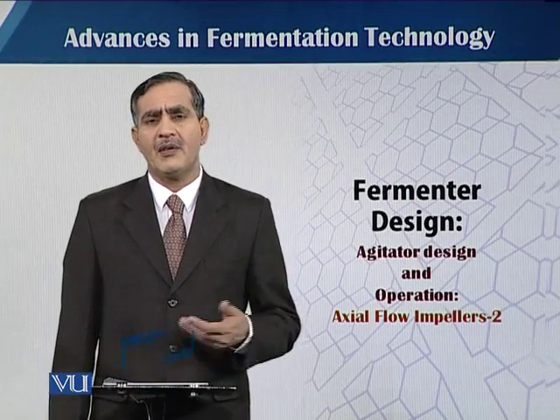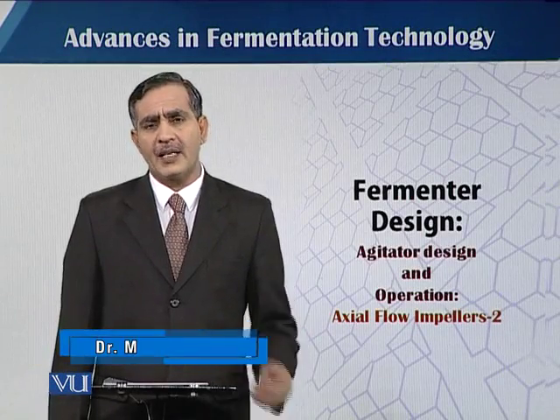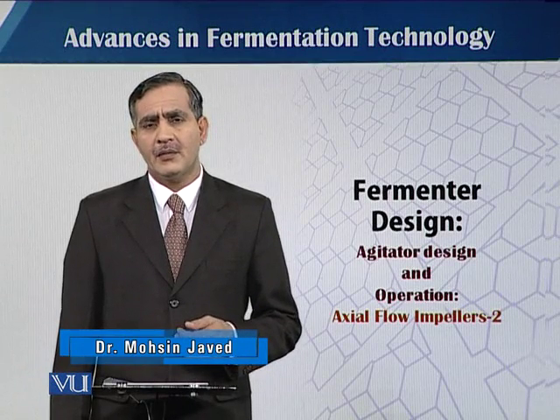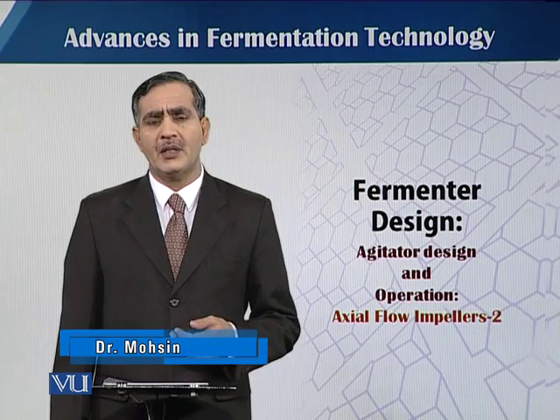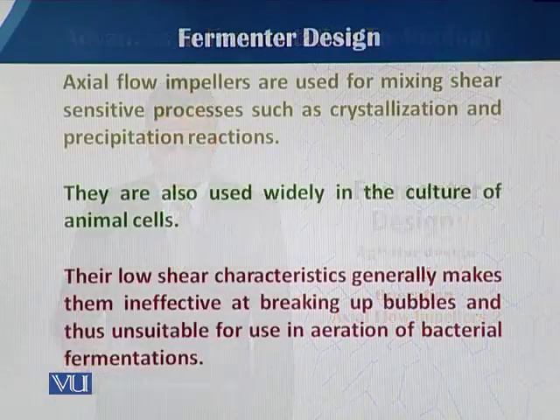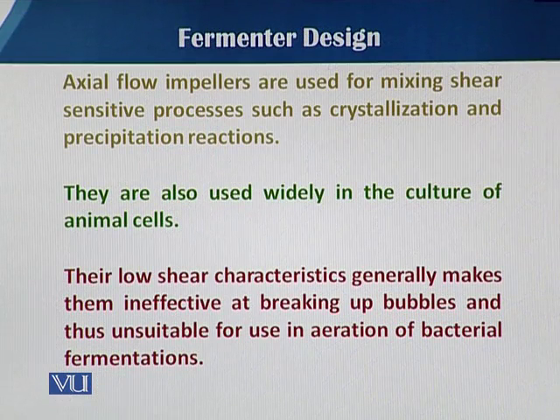As we have seen in our previous module about the axial flow impellers, in this module we will again talk about axial flow impellers. As we have already discussed, they are used when mixing shear-sensitive processes such as crystallization and precipitation reactions.